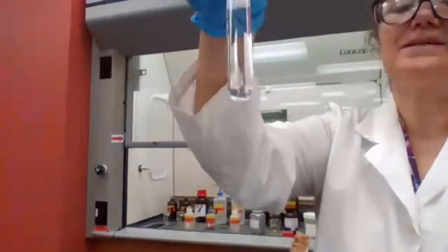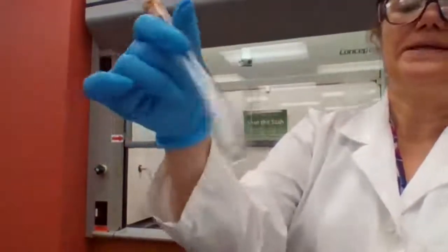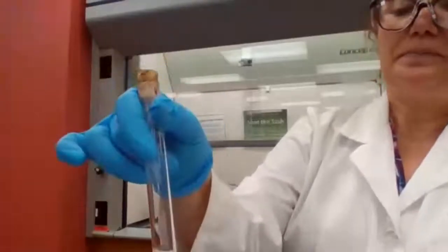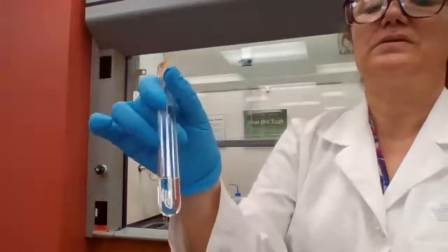Just for benzoic acid, yes. And then I'm now performing the experiment for benzoic acid and silver nitrate, and I want to see if it's going to work or not.